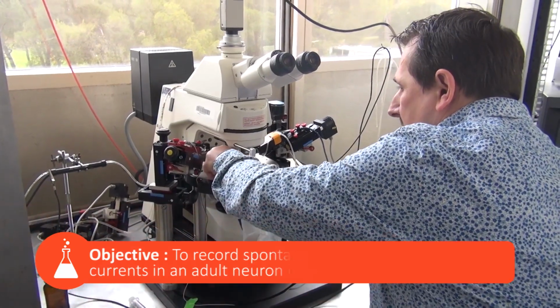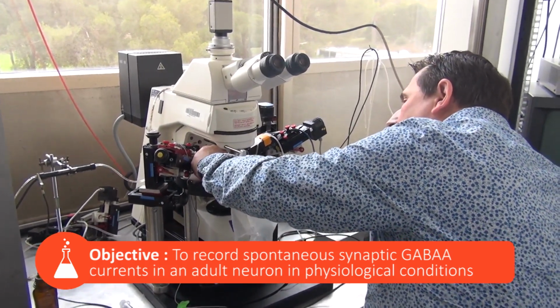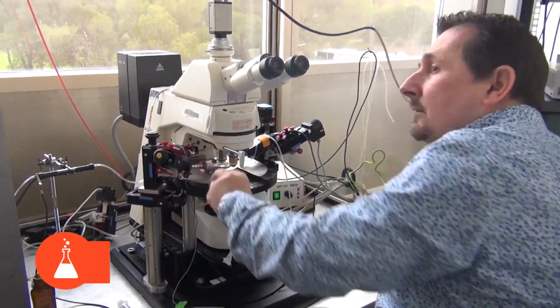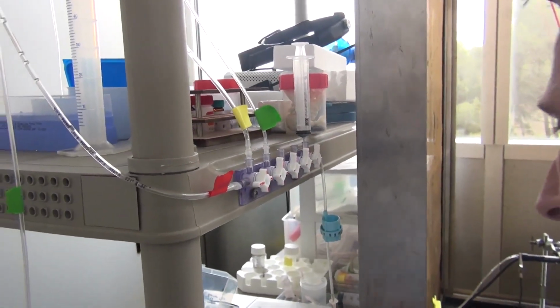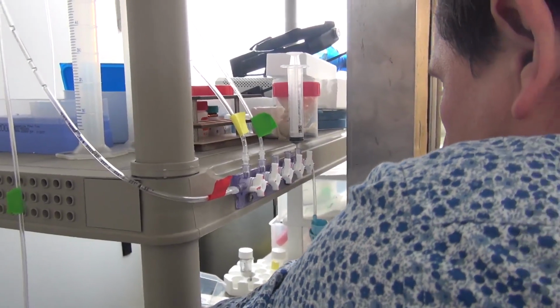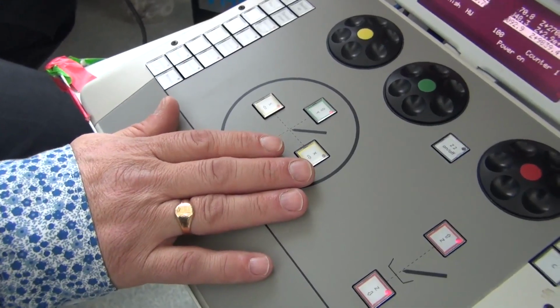We can separate the activity of GABAergic synapses from that of glutamatergic ones by applying a blocker of AMPA, kainate and NMDA channels in the bath, such as APV and CNQX. When researchers record spontaneous GABAergic currents from a single neuron, they get information on the activity of GABAergic neurons afferent to the one being recorded.